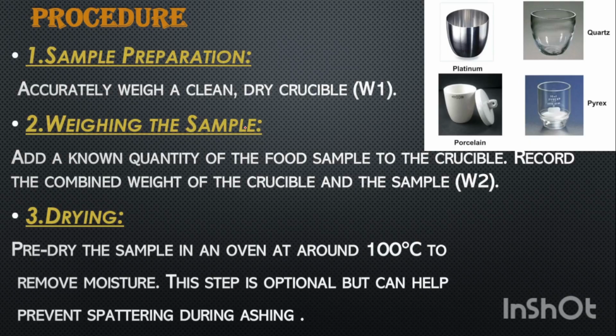This is the muffle furnace. It's a laboratory instrument that heats materials to a high temperature while isolating them from the fuel and the combustion byproducts. These muffle furnaces are energy efficient cabinets. They use conduction, convection or black body radiation processes. The inside of the muffle furnace is usually made up of brick and ceramic, while the outside is made up of steel. Here we keep the crucible where our sample gets heated by the heating elements.